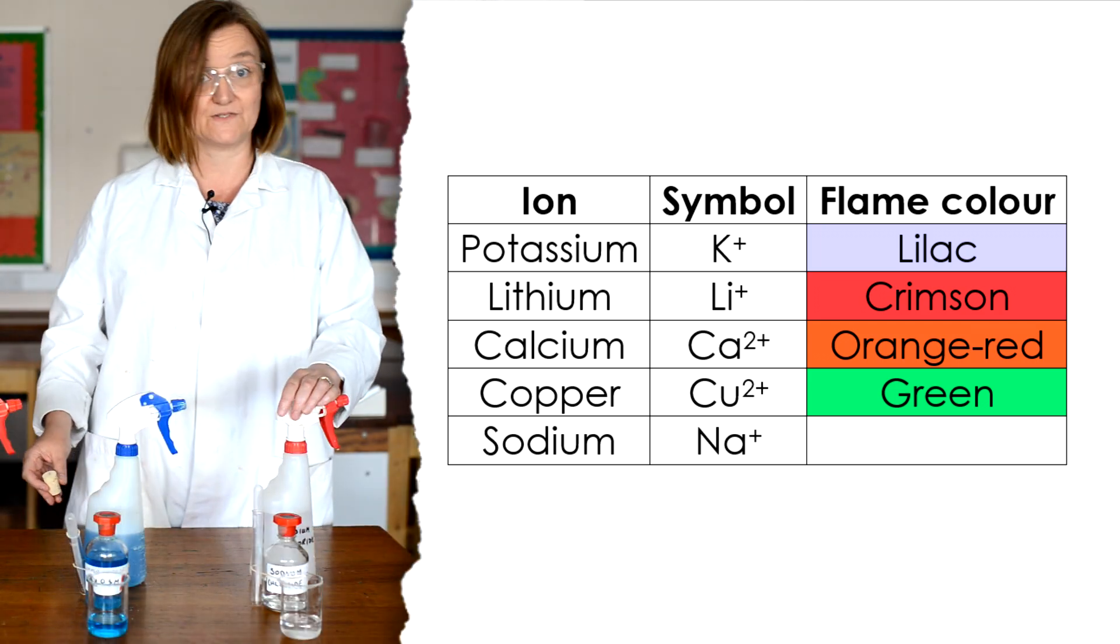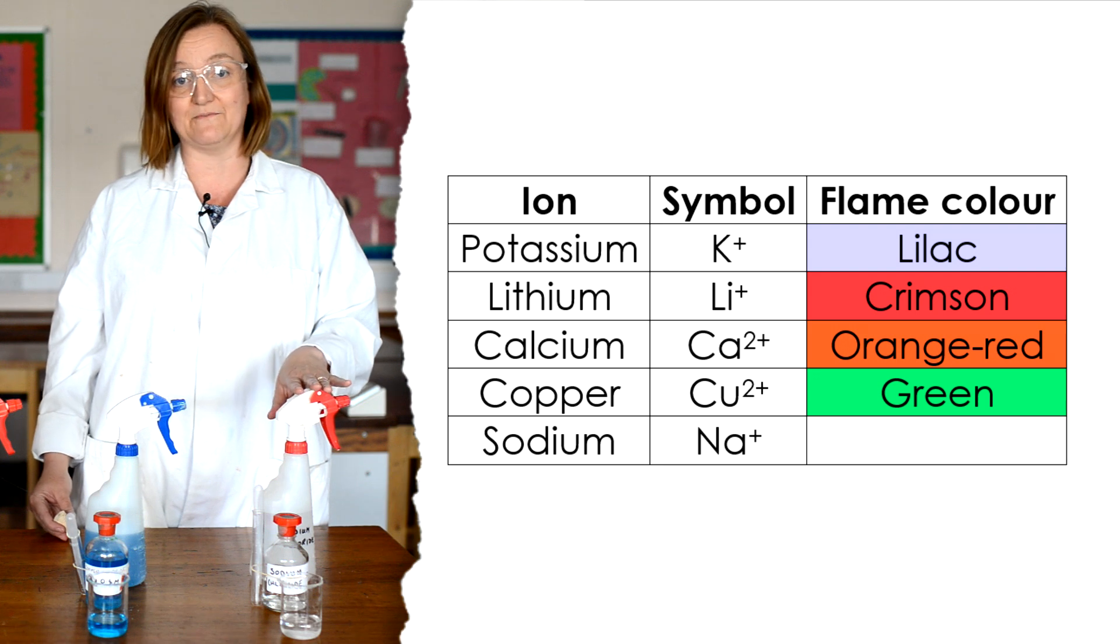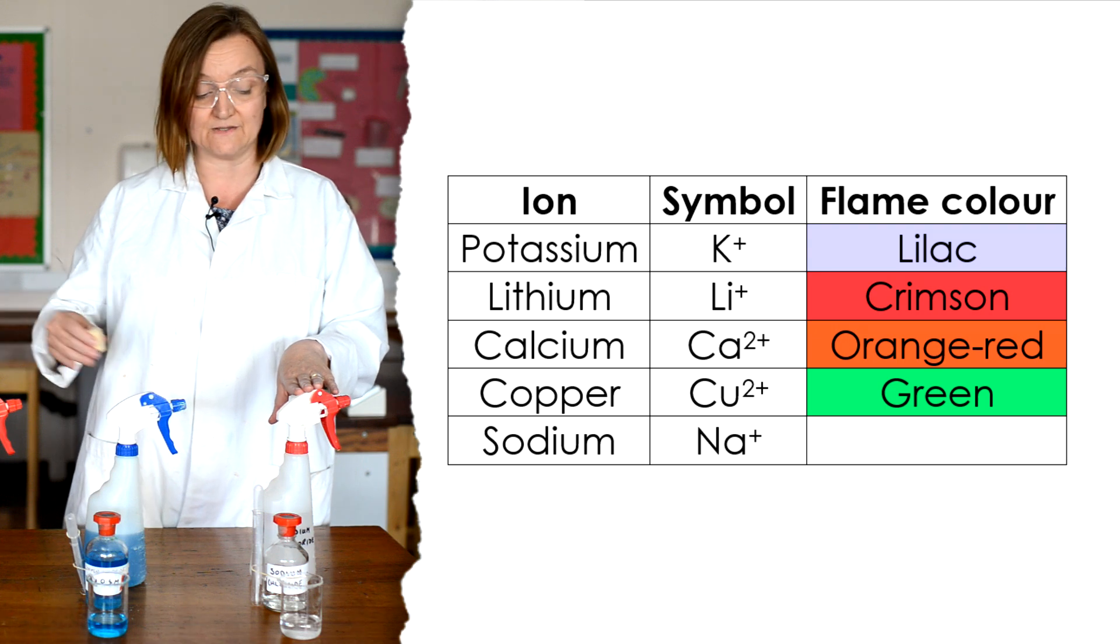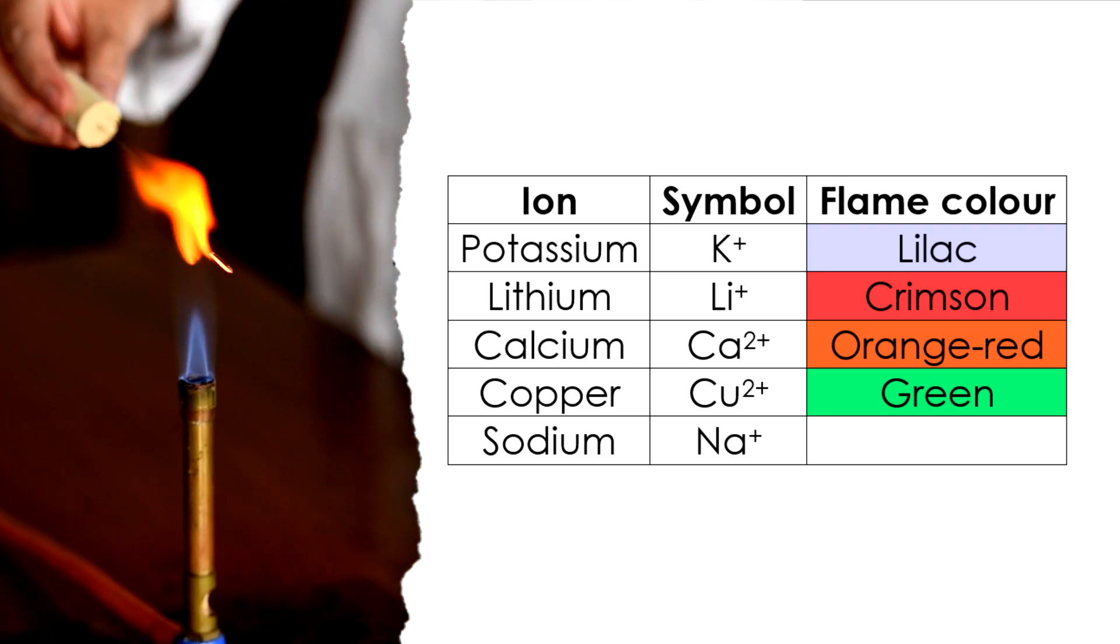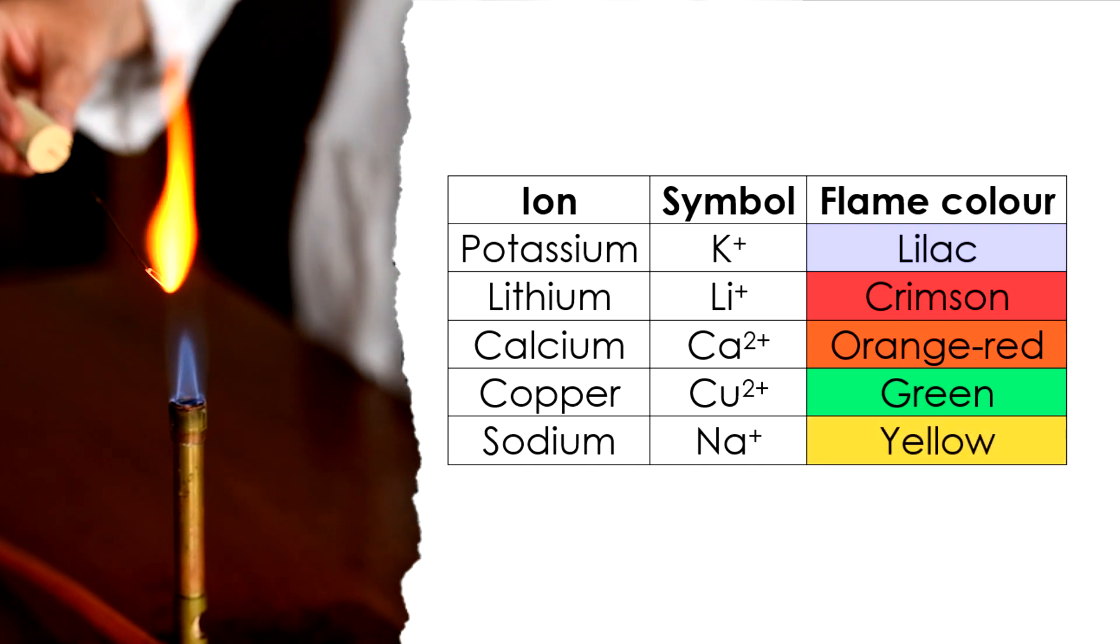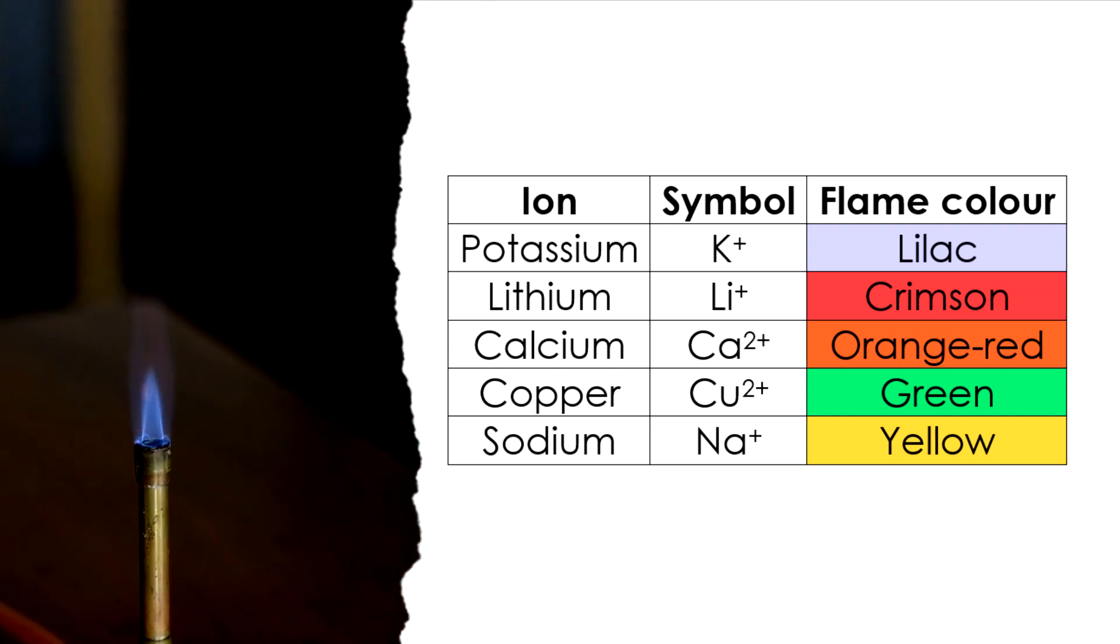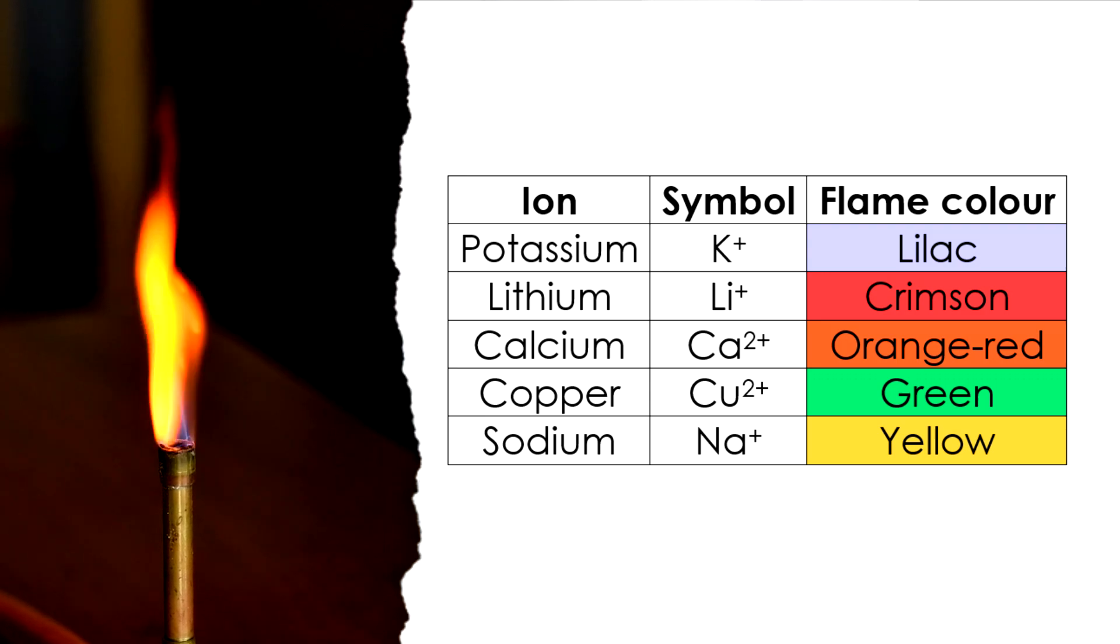And finally, sodium. Now I've deliberately left this one till last, because actually the flame colour is so bright and strong in sodium, if you do it first, it can actually interfere with the other ones. So with the nichrome wire, we see the distinctive bright yellow colour, and that's the same colour as you get in sodium streetlights. And finally with the spray, very obviously yellow.